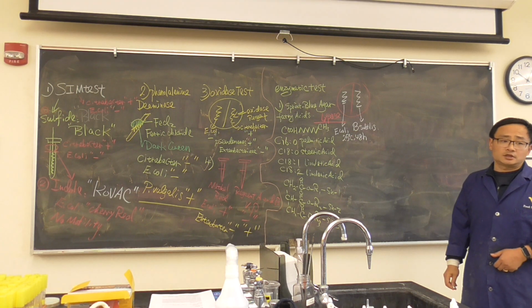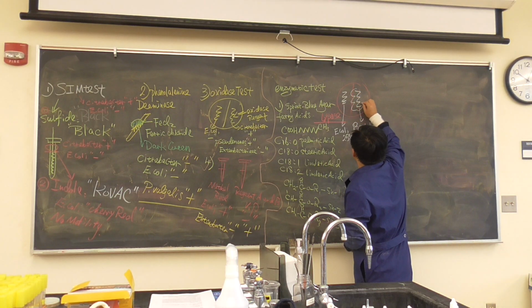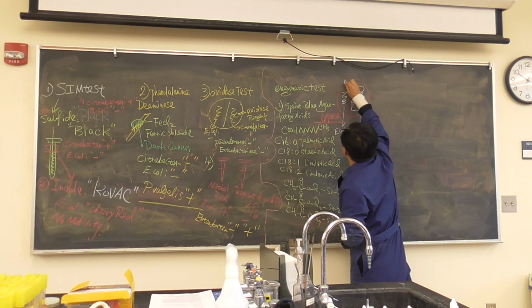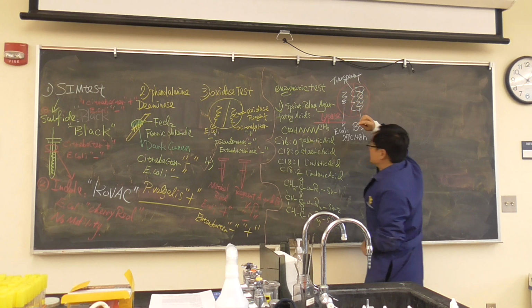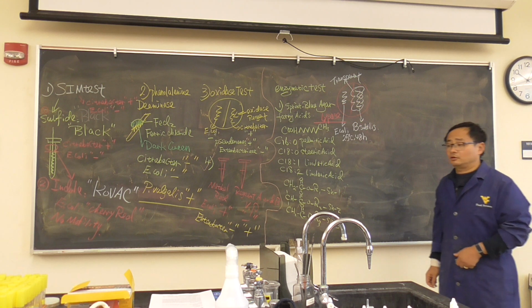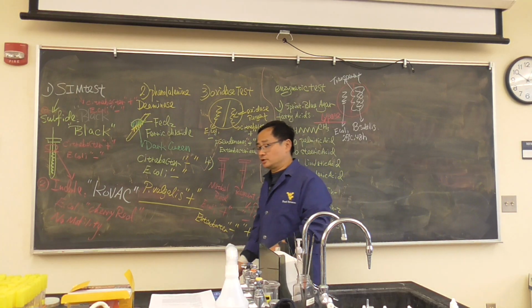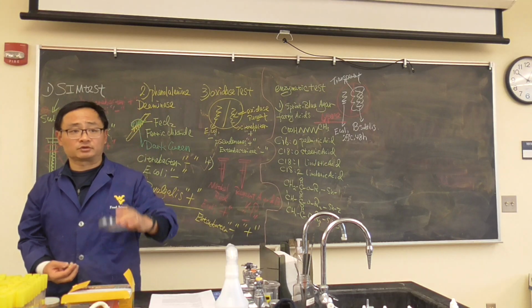If you see a transparent zone surrounded by one bacteria, that means it is positive. So one bacteria could be using lipase. So that's how we do this first one.